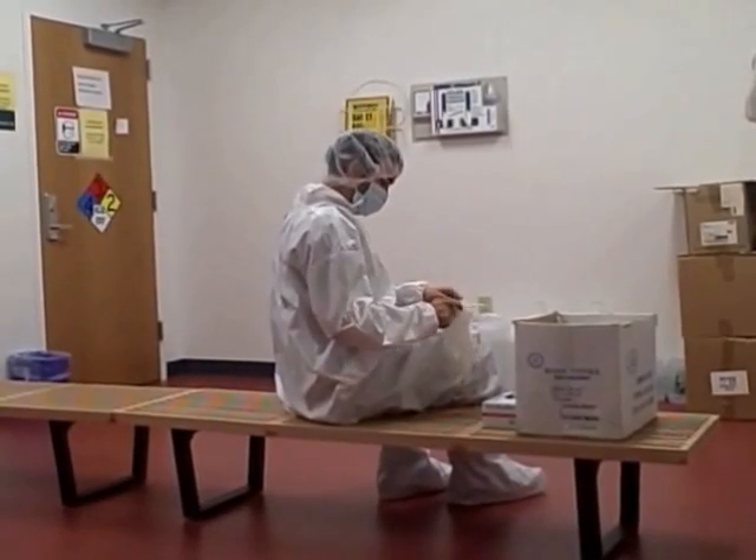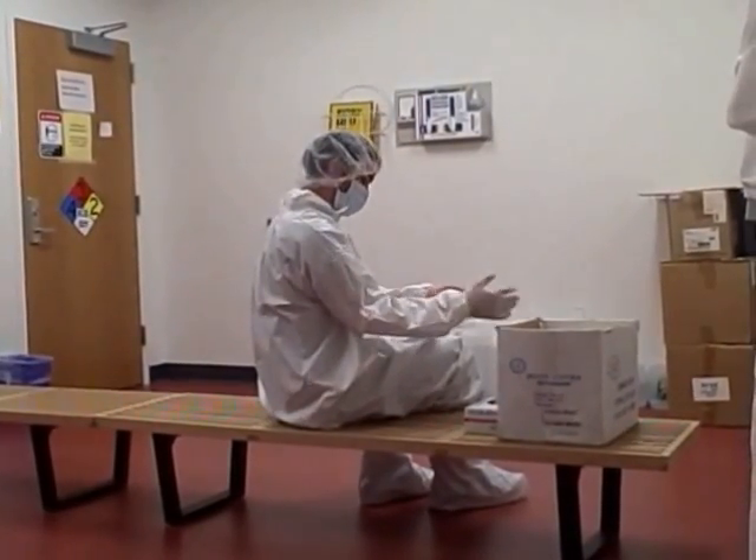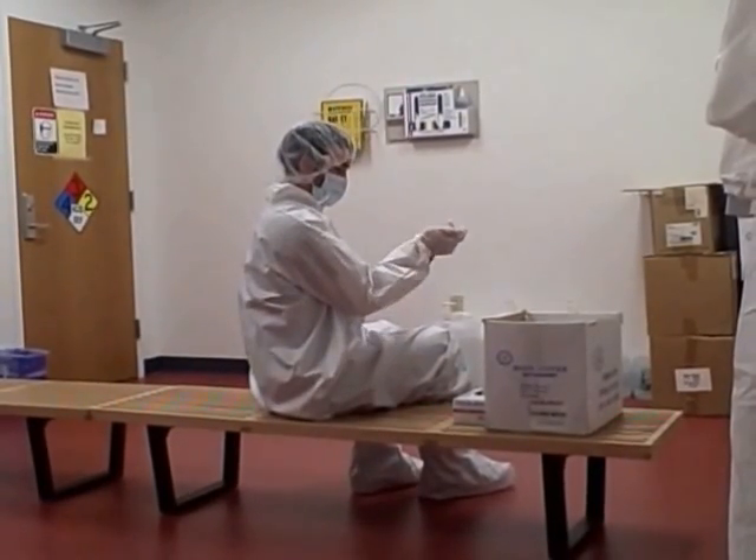Grab a fresh pair of gloves and put them on, taking care not to touch the fingers or palms of the glove with the skin. Make sure the gloves are stretched over the sleeves of the suit.